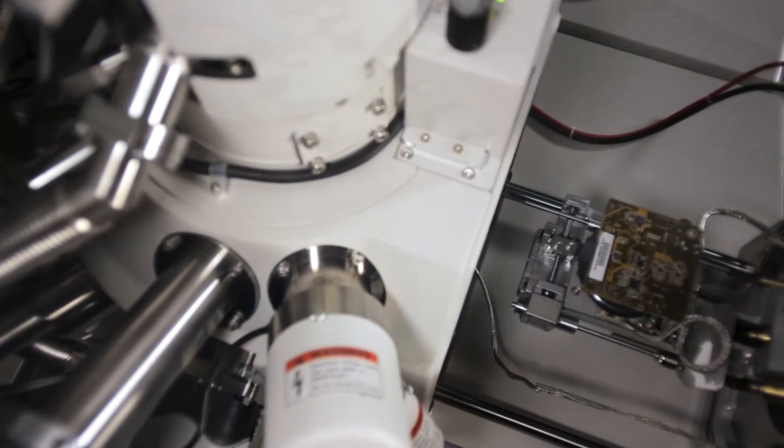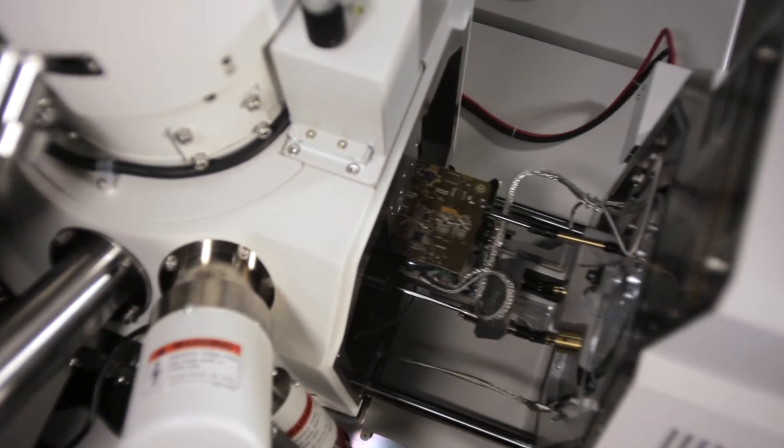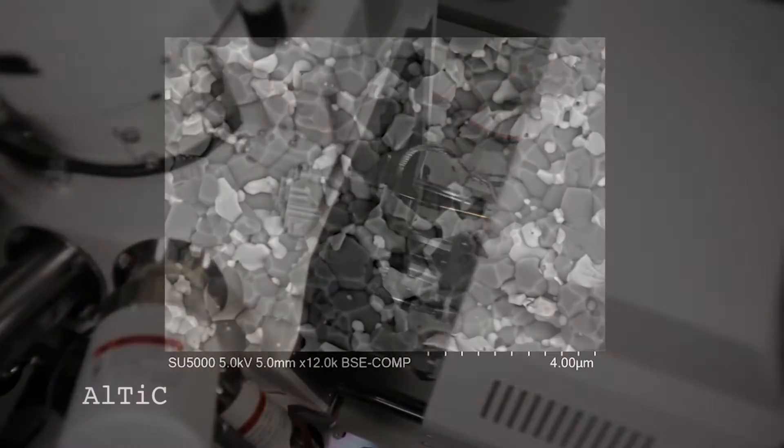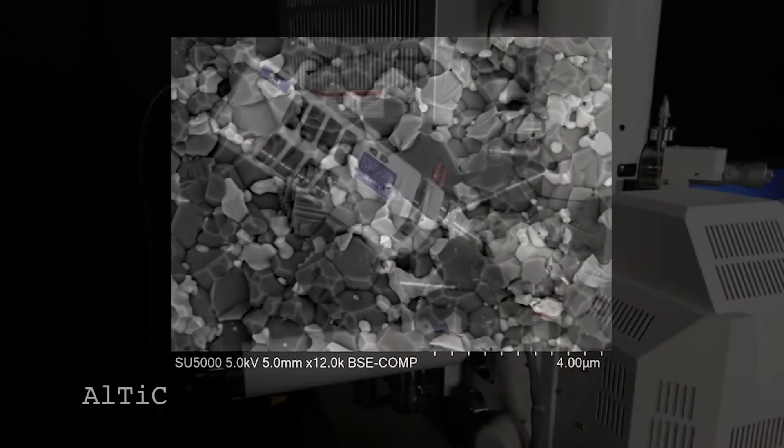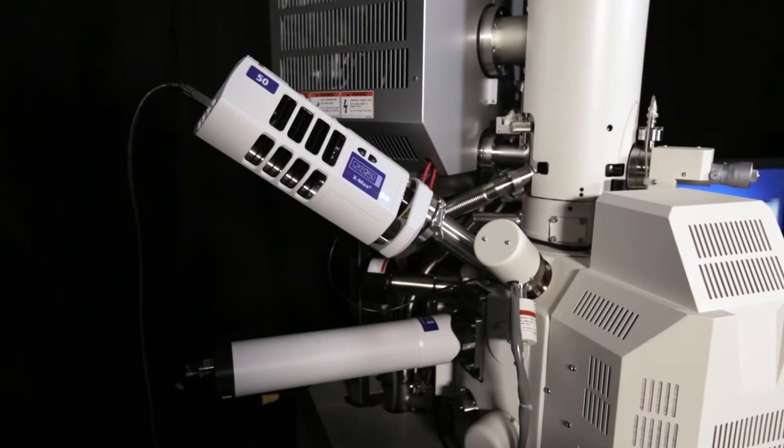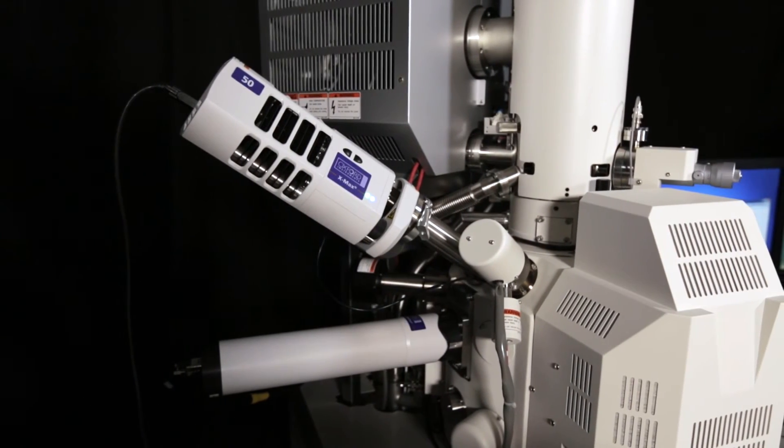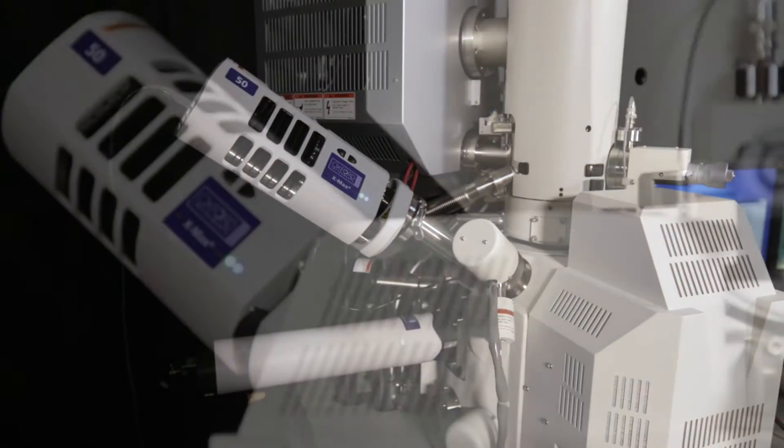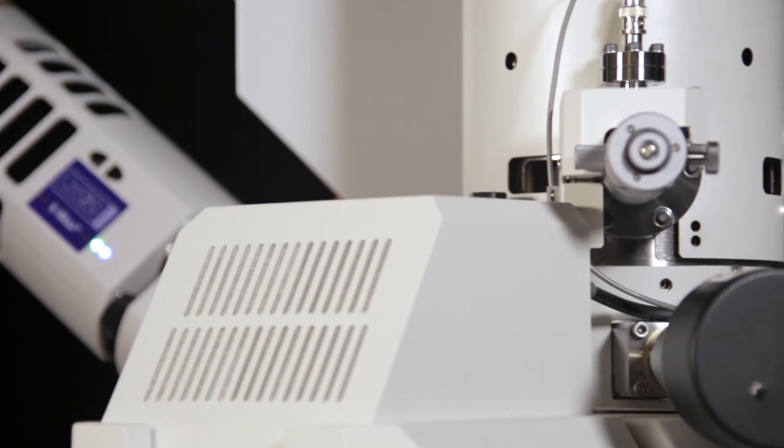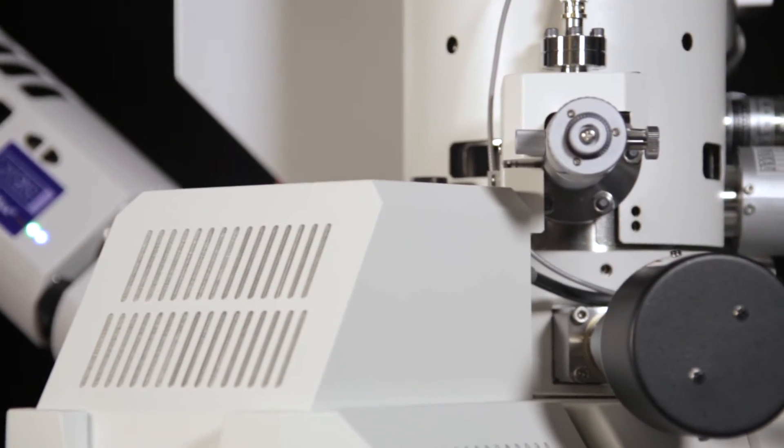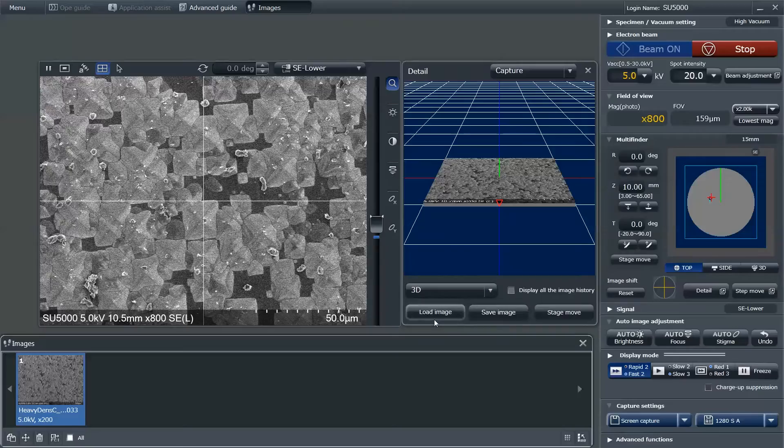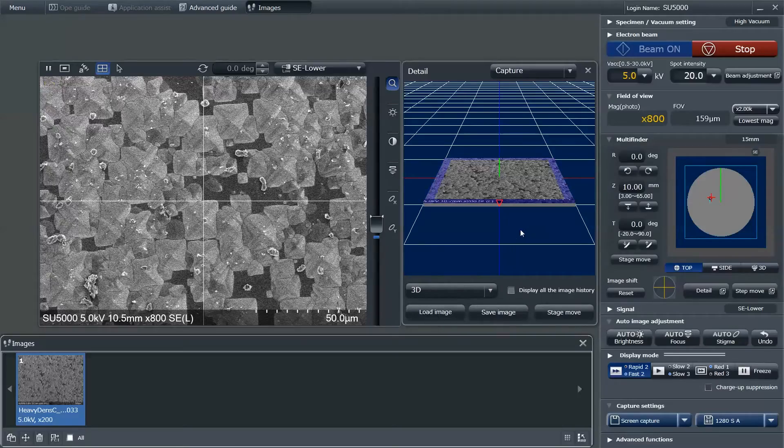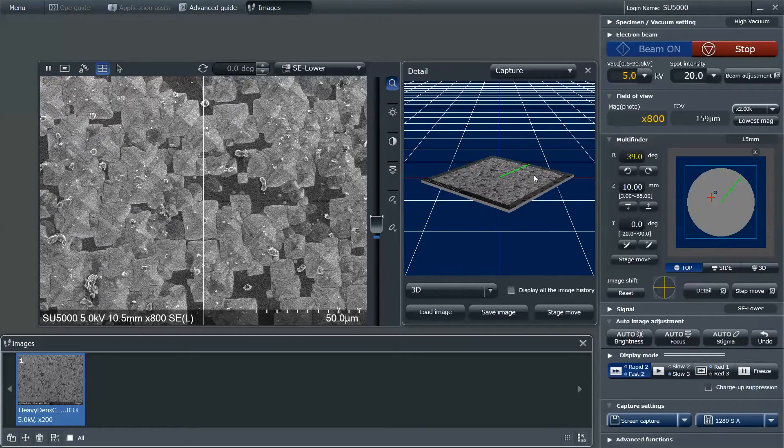Designed to meet the needs of high-demand industrial and academic laboratories, the SU-5000 provides the optimum balance of performance and accessibility for research success. This is most evidenced by the introduction of the revolutionary EM-Wizard user interface, a user-friendly GUI that is the core of the SU-5000 system.